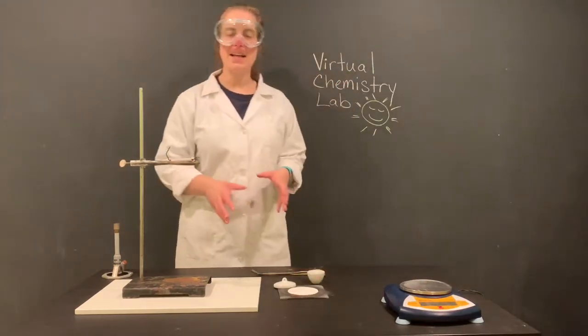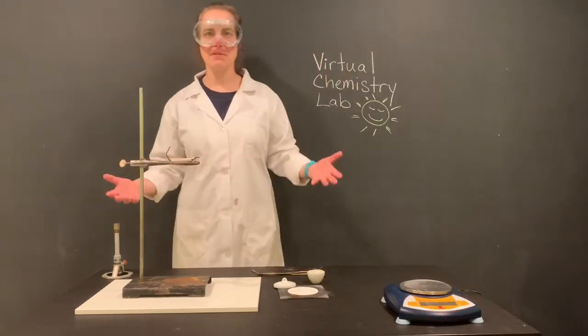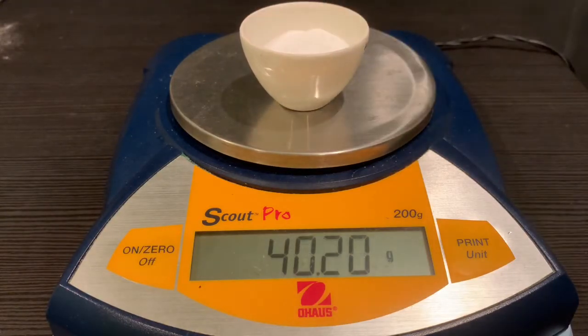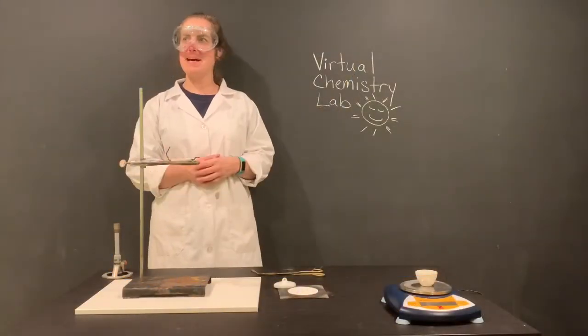After we do that, we're going to take it off and we're going to add in the mixture. Now everyone's getting a different mixture, so we're going to add in the mixture and then come in and record that mass. So we recorded that mass as well.